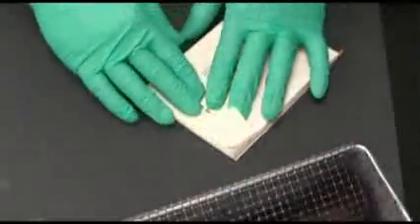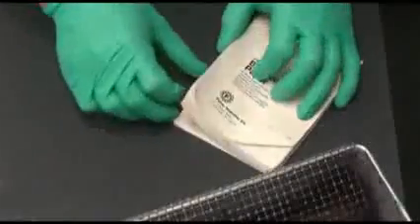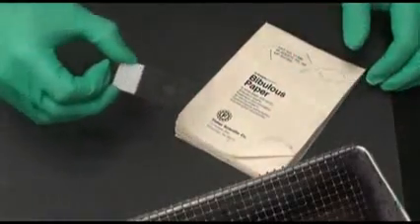As shown here, using different sheets during the process will aid in rapid drying. However, try to avoid wet or stained sheets. Make sure not to rub the slide, as this will remove the bacteria.